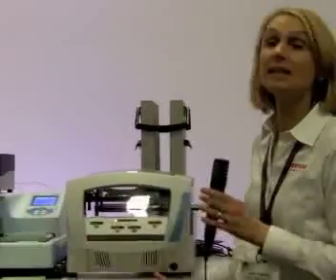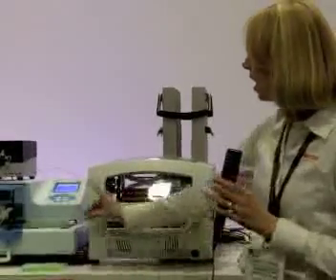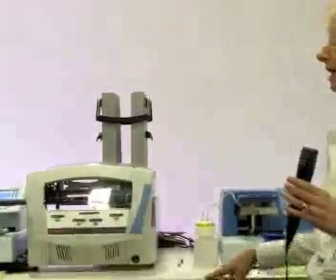As well, one of the key differentiators is that it has this arm that can feed both sides of the RapidStack. So it's dual loading, and it's the only stacker on the market that can automate two instruments at one time.